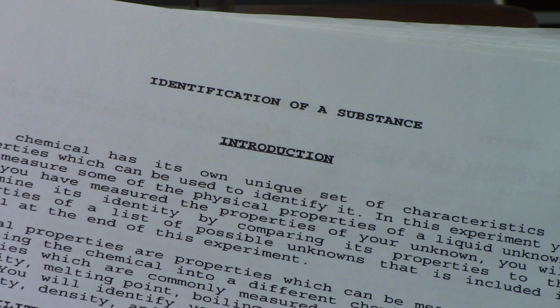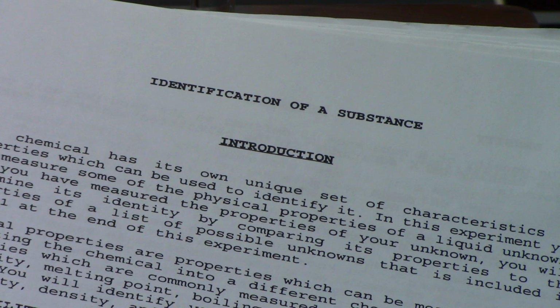And solubility is when you check to see if 2 liquids, or solids, or a solid and a liquid, can dissolve. So what we're doing is creating either a homogeneous or a heterogeneous mixture.